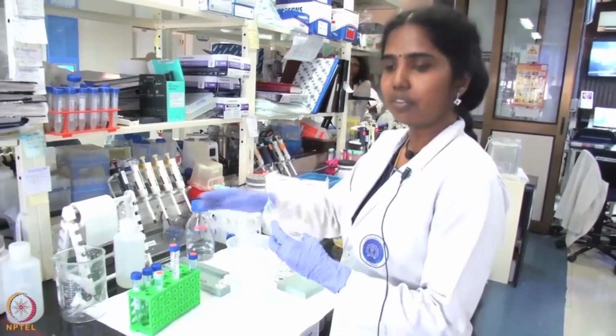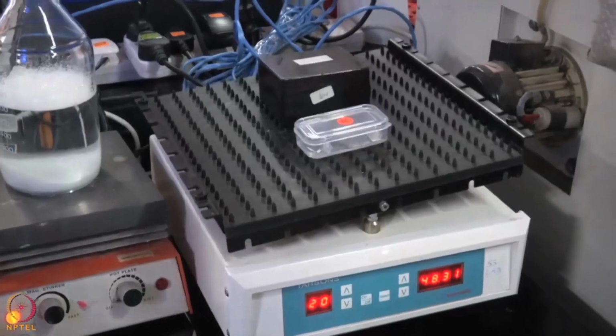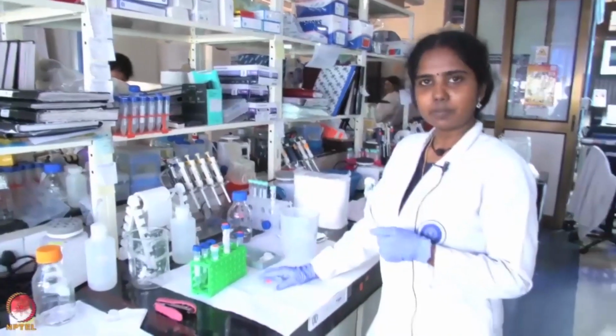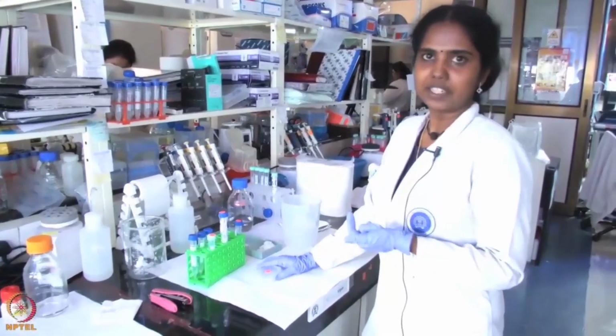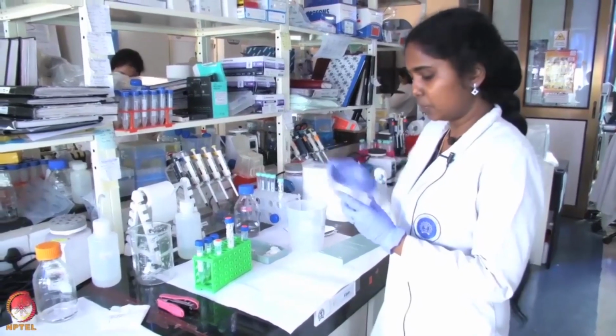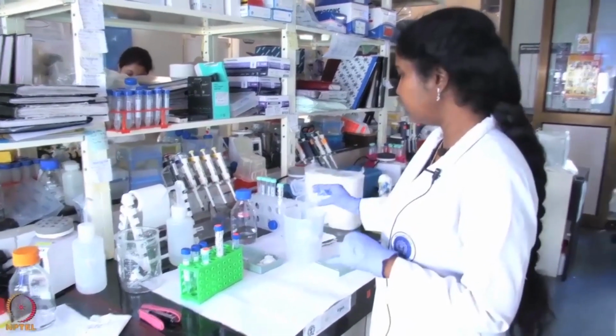Then you keep it for 2-hour incubation. After incubating with primary antibody, we again repeated the washing step. Now the next step is incubation with secondary antibody. So now we are discarding the washing solution.